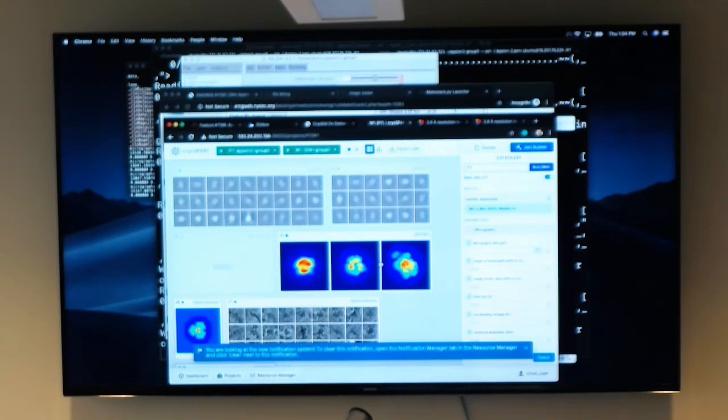Class zero, so particles selected must be some classes which are good, and we use those classes as a tool. We removed some of those. Okay, well, let's look at the inputs then. Look at the inputs. See, this is the particle selected, J6 particle selected. Let's look at J6 then. You want to look at this? Why is it 2? Okay. Yeah, let's look at J6 first.